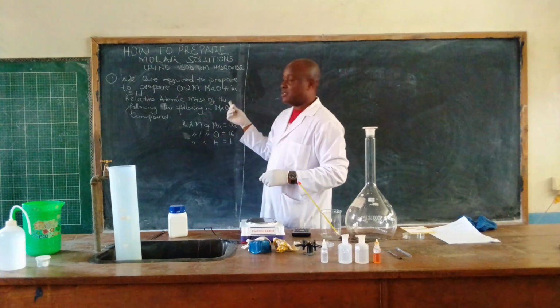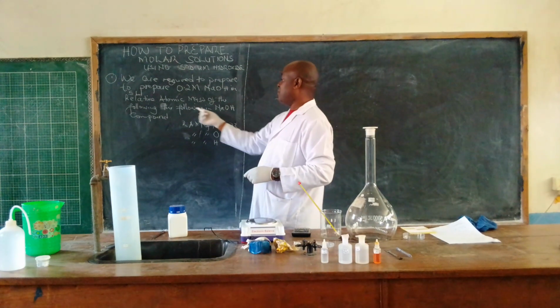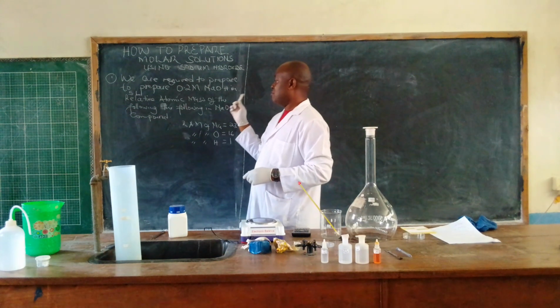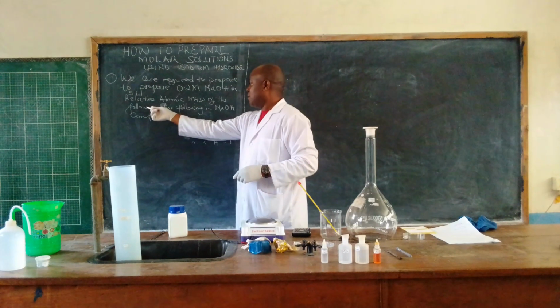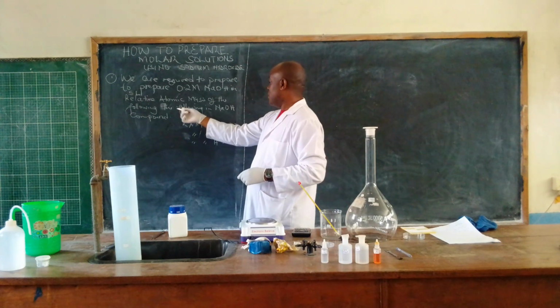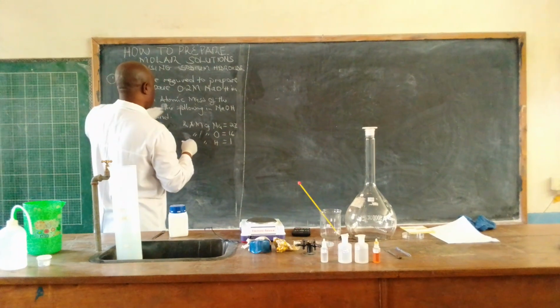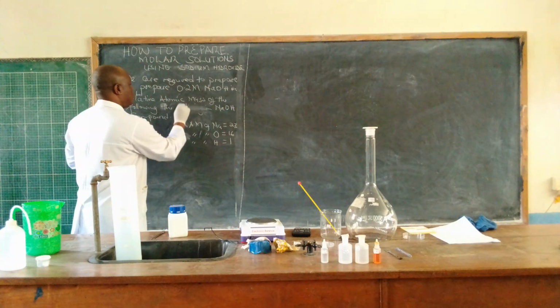So we are going to get the relative atomic masses of each of the following atoms.